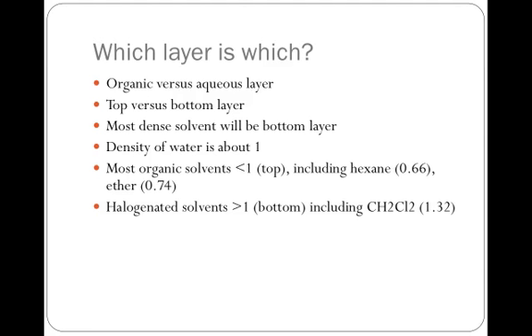Now, there are two ways to look at the material that's sitting in that separatory funnel. We will talk about the organic layer and the aqueous layer. But the layers are going to be stratified in that separatory funnel, so there's going to be a top layer and a bottom layer. Is the top layer the organic layer, or is the top layer the aqueous layer? Well, that depends. It depends on the solvent that you chose.